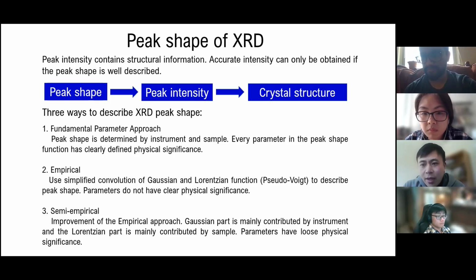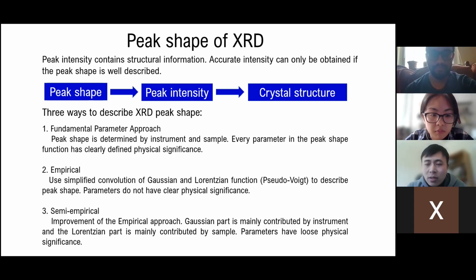Everything really hinges on this relationship, right? How we can understand the positions of thousands of atoms in the crystal by simply looking at the X-ray diffraction peaks. There are more details, but the core is the structure factor, which relates the atomic positions to the peak intensity we see.